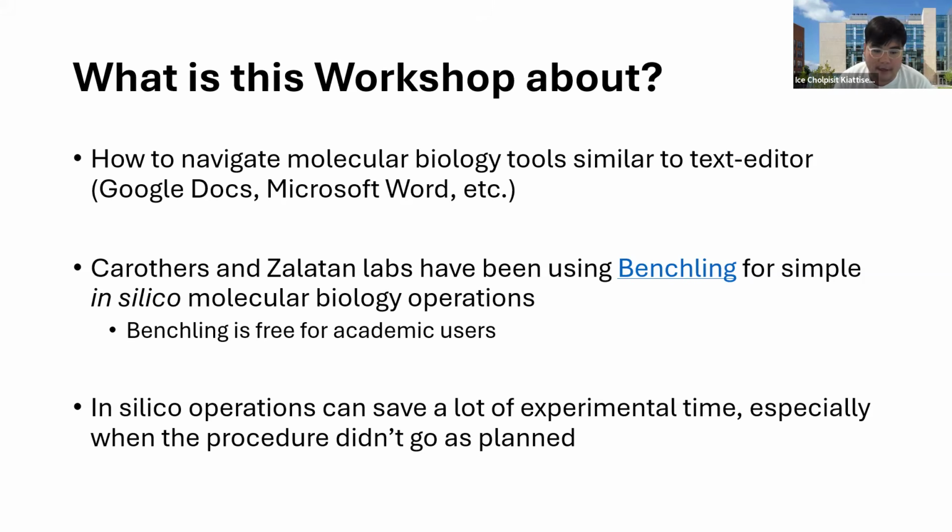One thing I want to mention before we get too far into our presentation is that I'm very pro doing in silico cloning, or in silico operations in any tool, before you do the actual experiment, because sometimes it saves a lot of time. When you know that the experiment is going to fail before you actually do it, that helps a lot. But sometimes you don't really know how to do it properly, so maybe today's process can show you a little bit of what is possible out there with these tools.